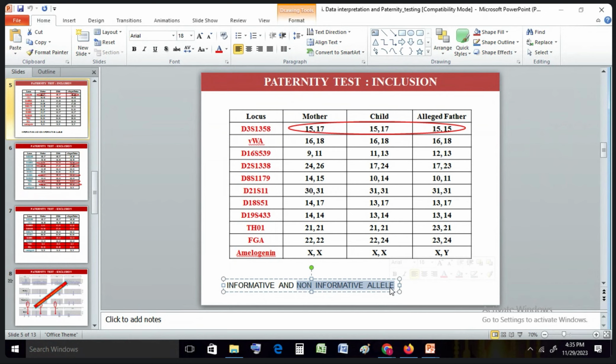Question, sir. You said that if up to two mismatches occur, we can admit. Will that come? That comes after you have checked all the loci, then you get the result. Now, what is the result of this? It is not even match, not even mismatch. Just exclude it.